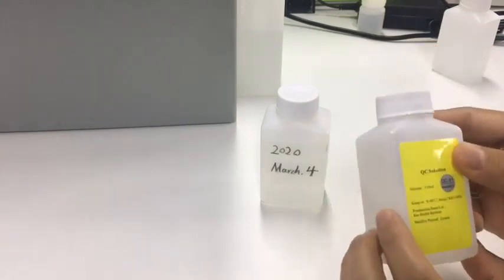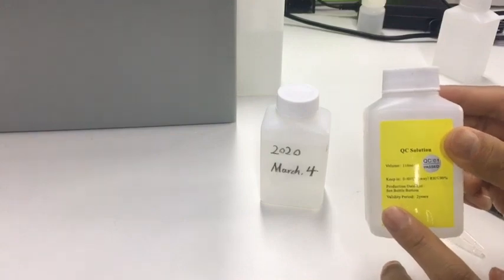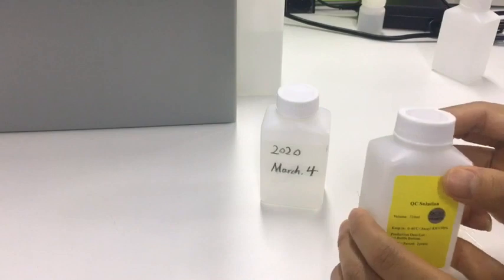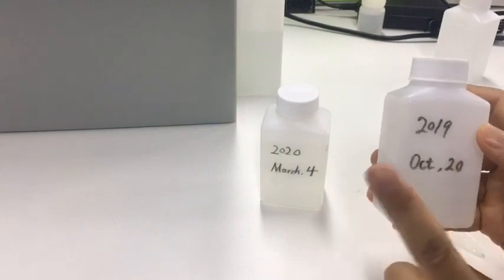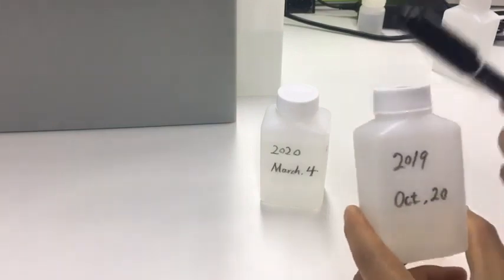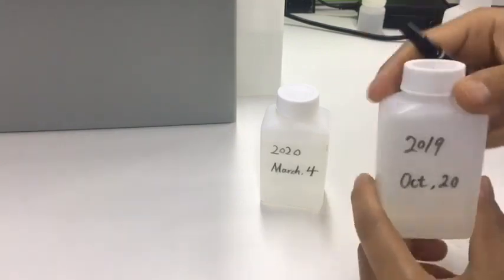The warranty period is two years before opening. But when the bottle is opened, the validity is one month. So use a pen to mark the date on the bottle so it will be obvious.